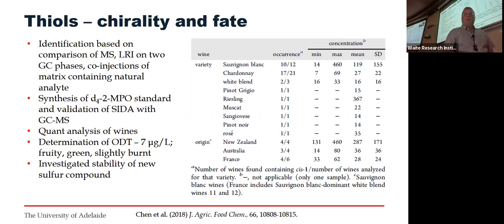So we went through a few steps, comparing mass spectra, retention indices on 2 phases, co-injections of the analyte into a natural matrix containing this natural analyte as well to prove all these things. We produced the deuterated standards and quantified a series of wines then.